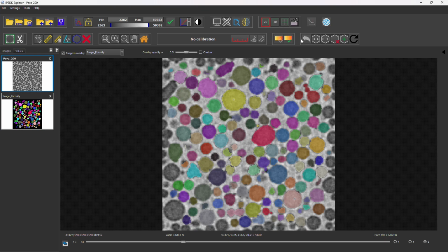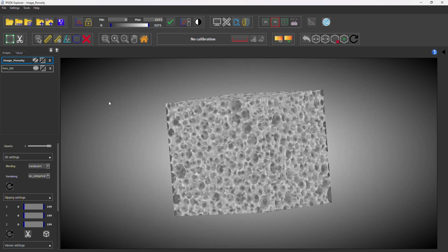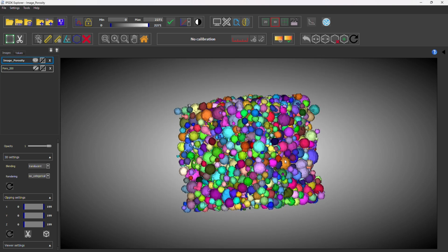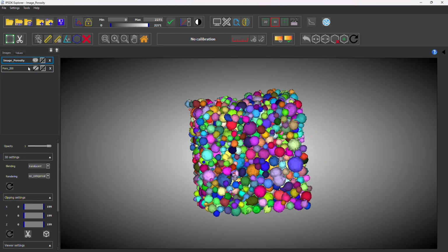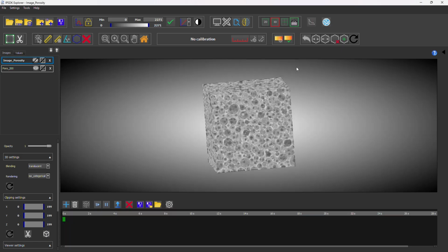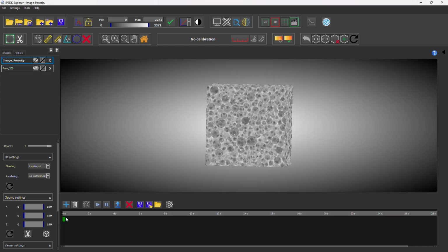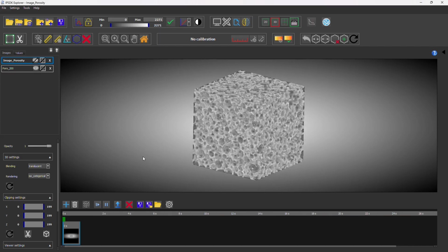Okay. Another thing that we can do is about 3D. I mentioned to you the 3D, and we can visualize the data sets in 3D. We can analyze also the results. And we can also do maybe something like show you how the Movie Maker works. But basically, you go with your data set. You can create a scene. Here it is. I can go.